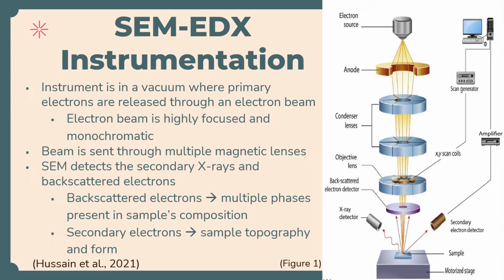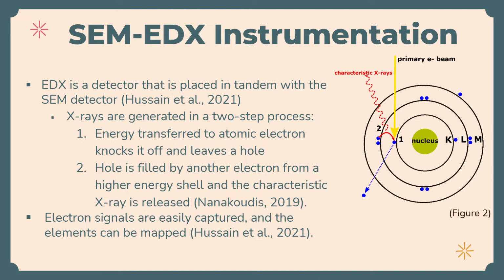Backscattered electrons can visualize the various phases that are present in a sample's composition or general makeup. The secondary electrons visualize the sample's topography, or the direct nature of the sample. EDX is an attached detector that is placed alongside the SEM detector.